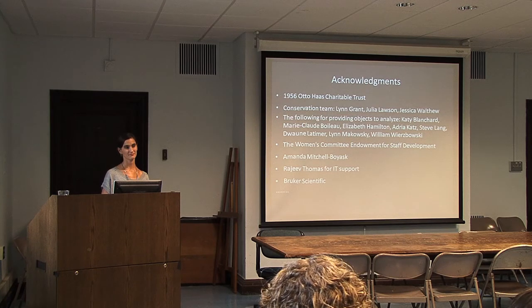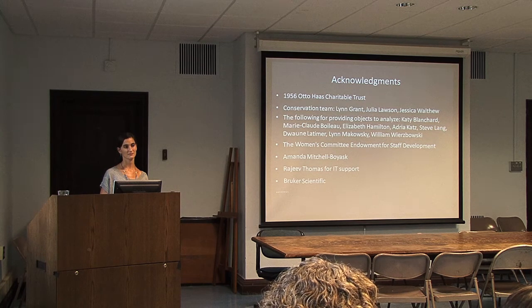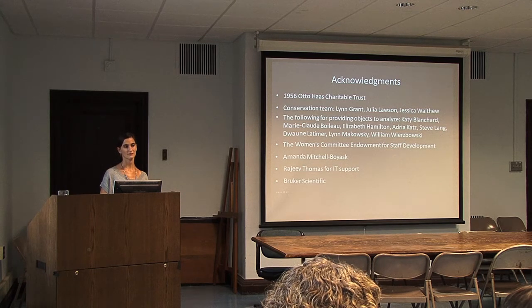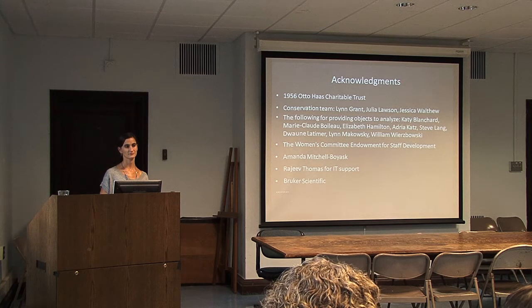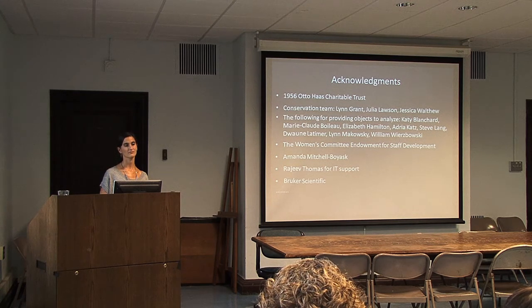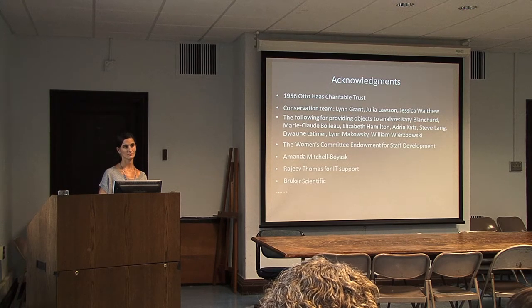And one thing about any of these analytical things is, once we have the data, the more people start developing the data, you get to a certain critical mass where you start understanding things. And one of the great things about the combination of now having this instrument and EMu is that we will be storing all of the information that we get from the pXRF. And Nina can sort of explain a bit more what she's been doing with that.